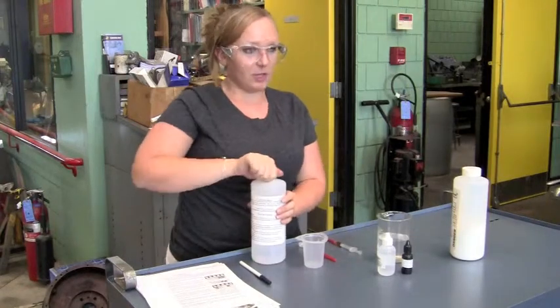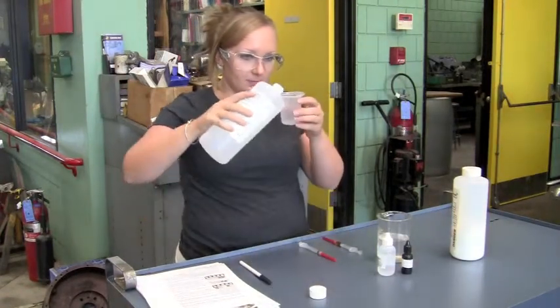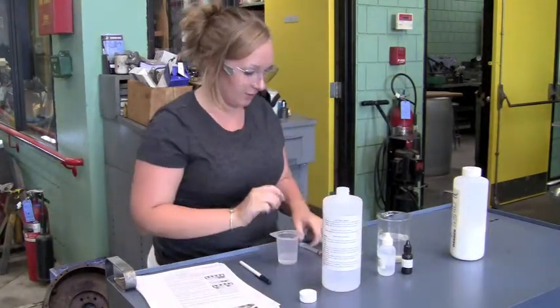First thing you're going to do is measure out 10 milliliters of isopropyl alcohol and remove any excess.